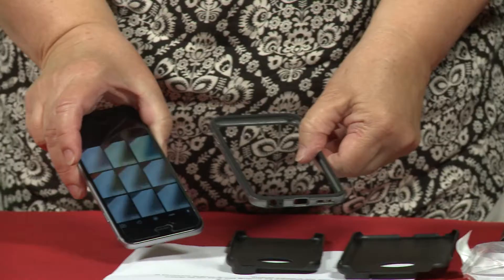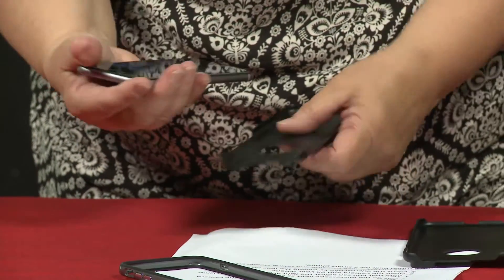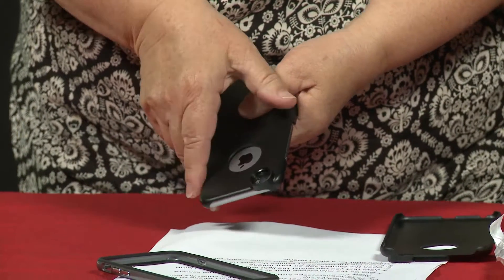I have taken the cover off of my iPhone here, and I'm going to fit it into this cover, making sure that the hole here is where the camera is.